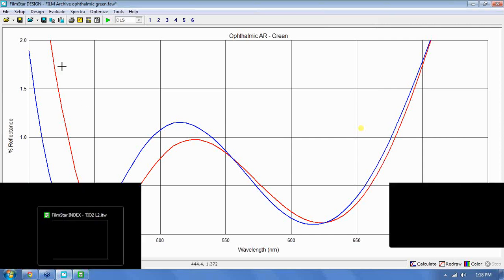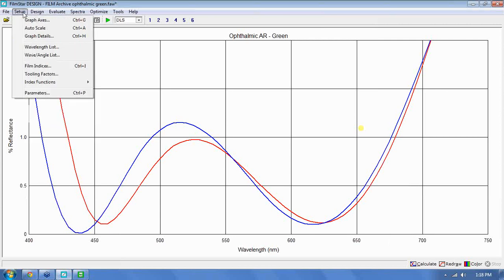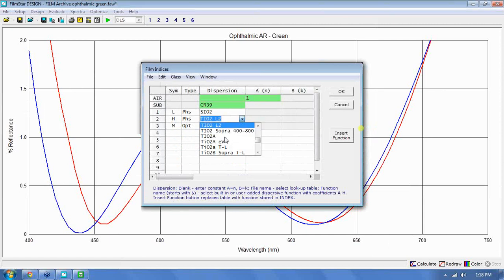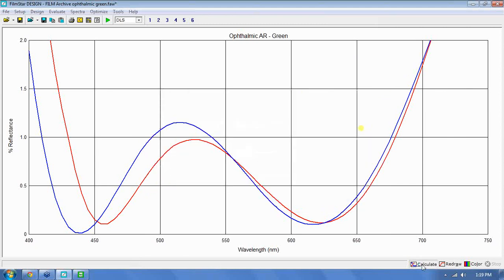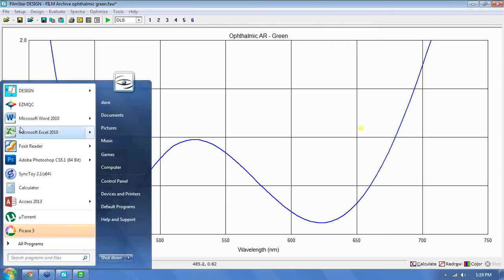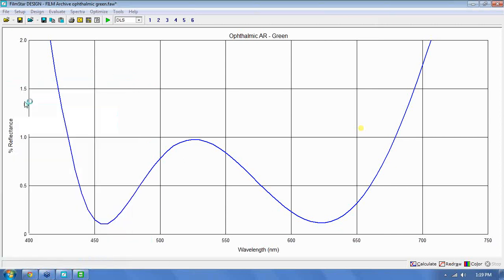And I'm just going to move this. I'm going to put our design back to our good sample. And that's what we want to start with. That's the process that we've set up, or the process that we've purchased from a vendor. Excuse me. And so if we're using our Hunter Lab, and in this webinar I'm using the Hunter Lab as an example, we'll open up our Hunter Lab software.